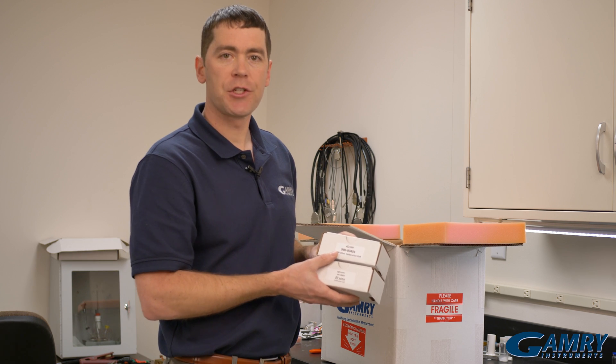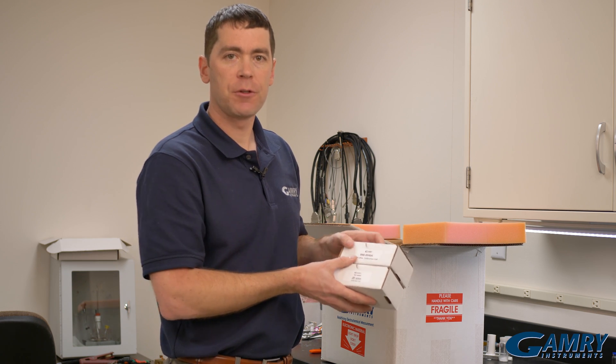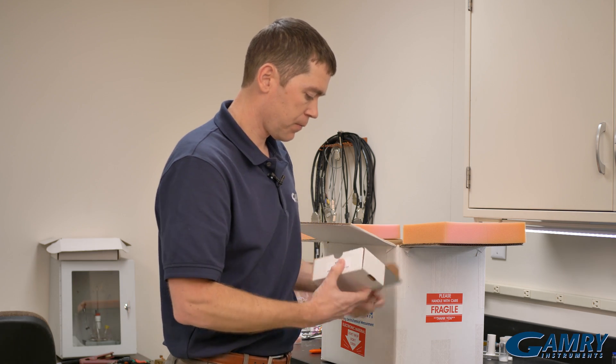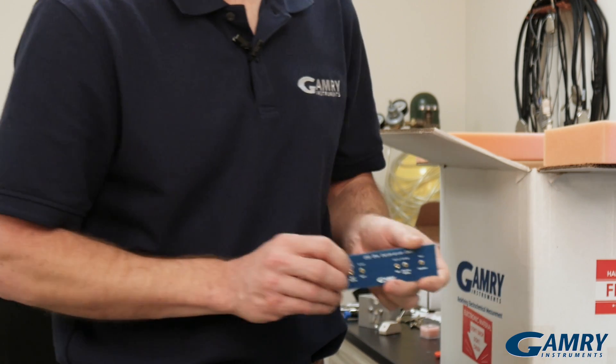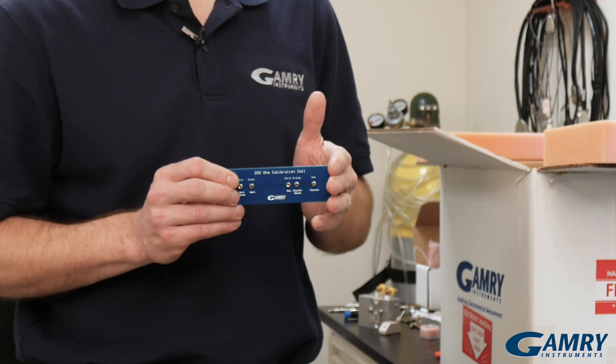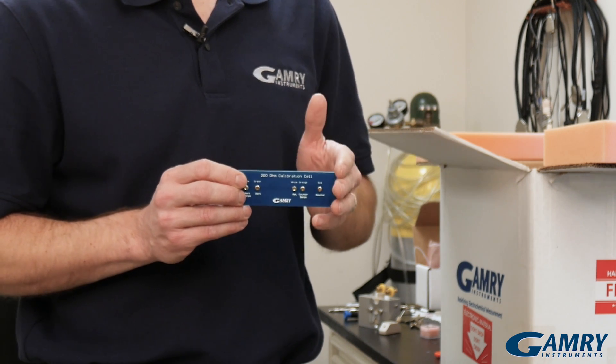Next we come across two calibration boards. Inside each of these boxes is a small calibration board that's used to calibrate the instrument when you initially start it up.